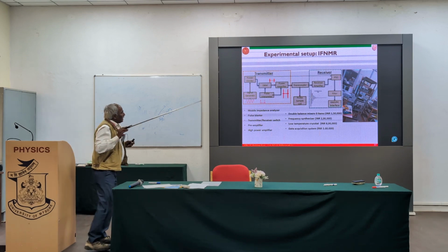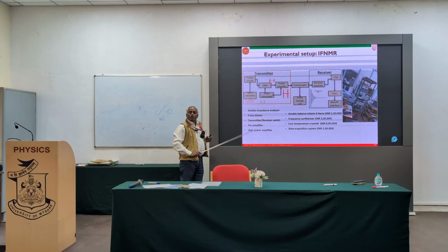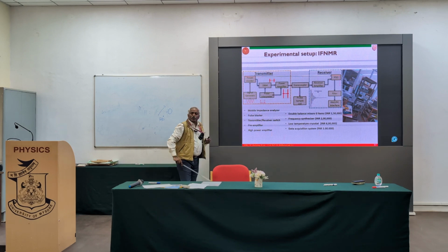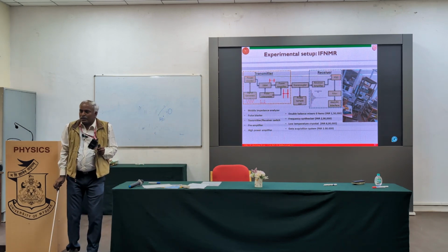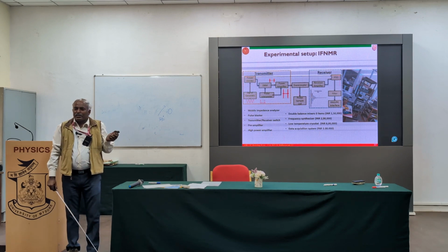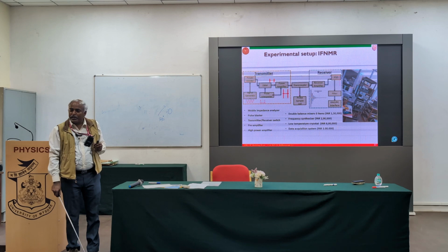Go back. And here basically what we do, this is a signal generator. It generates some pulses. The signal is applied to the coil only during a small time period, about 1 or 1.2 microsecond pulse width. Only during 1 microsecond do you apply it, like shining a sharp light. Then I measure the relaxation. How does my material behave?